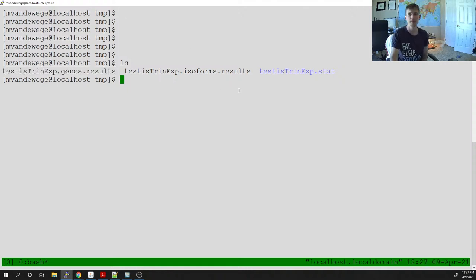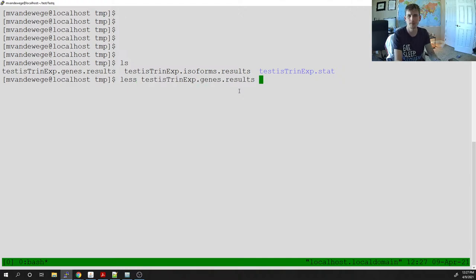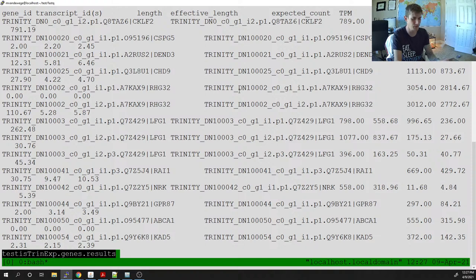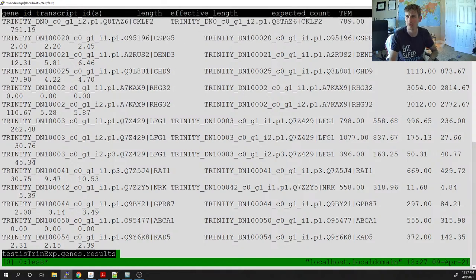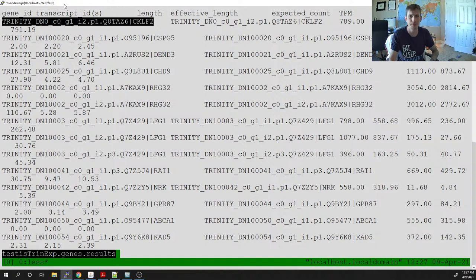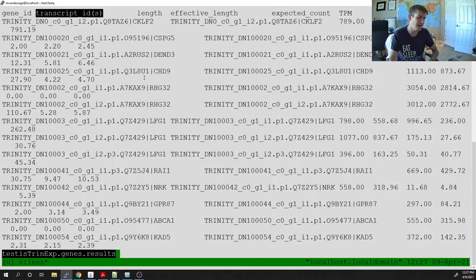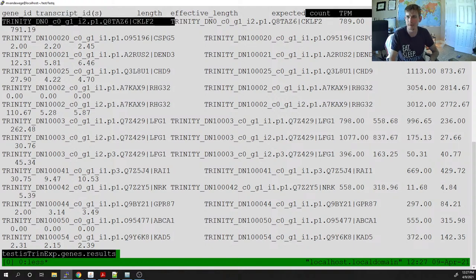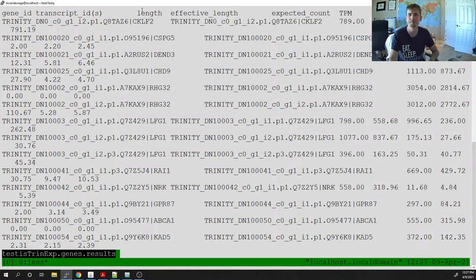The only file I really care about is the gene results file — the most important one. This is a tab-delimited output file, not comma-delimited. The first column is the gene ID, which is the gene or transcript ID. There's also a transcript ID column — a bit redundant, same name twice. Then we have the length — the length of the gene.